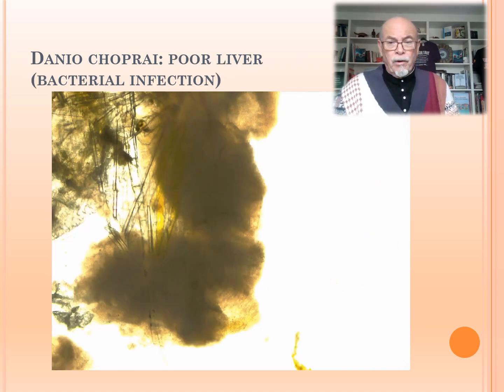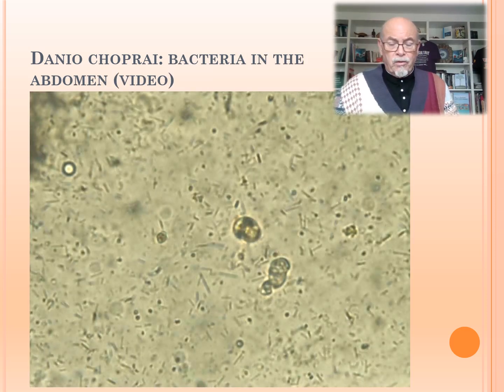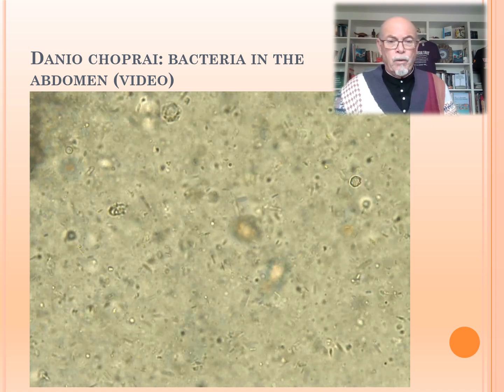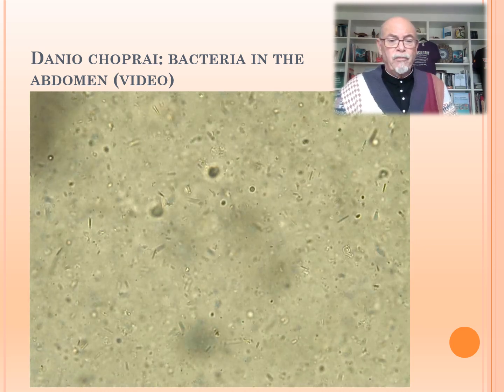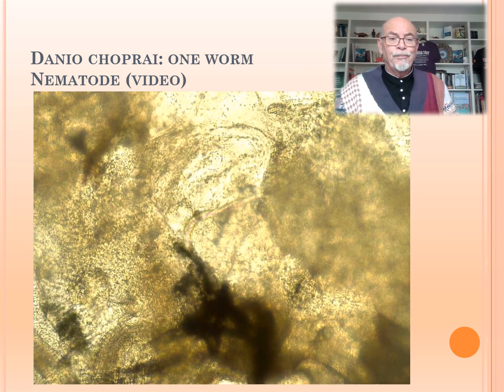And then also the fish can become weak, and due to the bacteria coming into the gills can get to the internal organs, and then you have a bad liver, like in this case here. So the liver is damaged. And then internally we find that bunch of bacteria, rod bacteria, round bacteria, whitish bacteria, maybe 3-4 different kinds. So in this case, this fish already had an advanced infection of a bacterial infection going on. So that's why you need to think about the treatments.